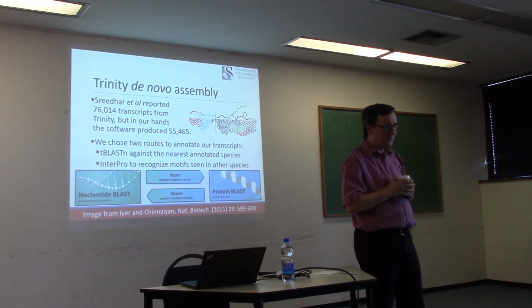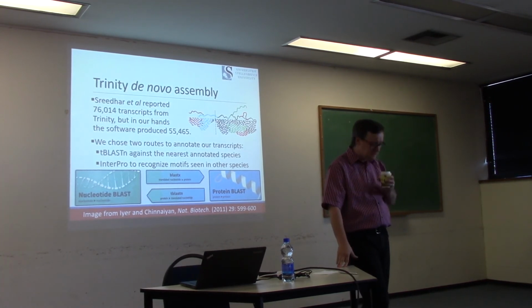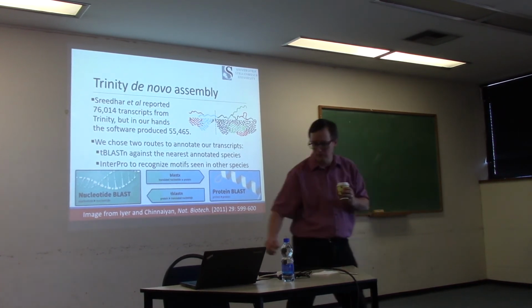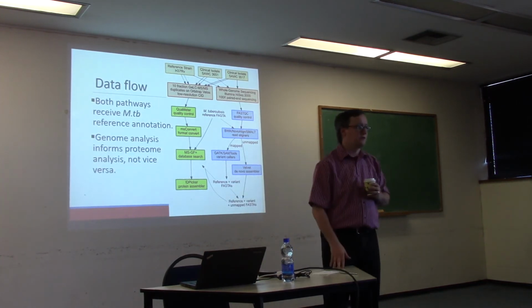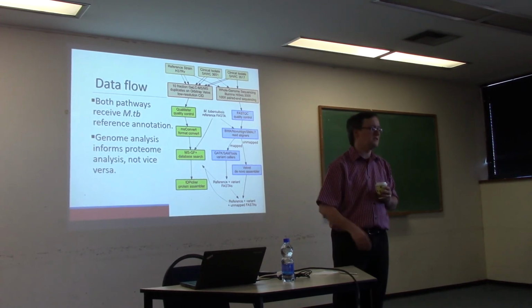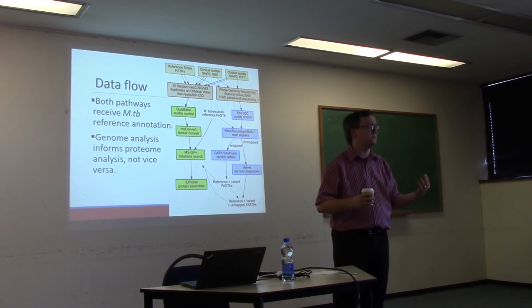Your proteomic data versus your genomic data. So the genome doesn't change depending on the conditions that you're growing your bacteria in. The proteomes that you've got from your different strains, what conditions were they grown in, and how likely is that to be similar to a real lab situation? These are mostly just exponential growth. We're not putting them in oxygen-starved conditions, nothing to emulate what it would be like if they were going into a more dormant state in somebody's lungs. So these are just trying to go as deeply as we can. How can we rapidly get as much protein mass as possible?